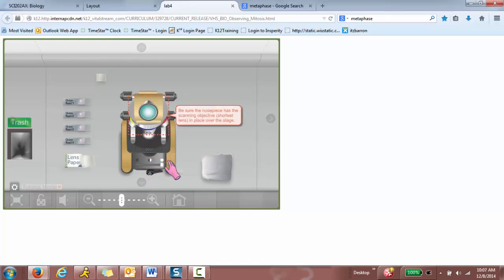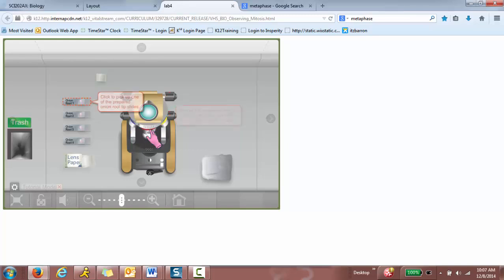Be sure the nose piece has the scanning objective, shortest lens in place over the stage. So 40x is too high. You want to go to the shortest one. Click to pick up one of the prepared onion root tip slides. And the shortest one is 4x. So you always want to start with the lowest one.